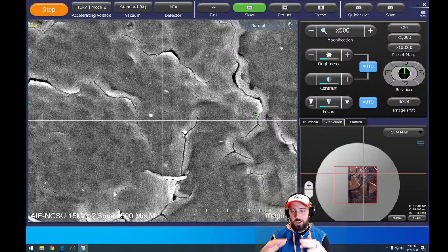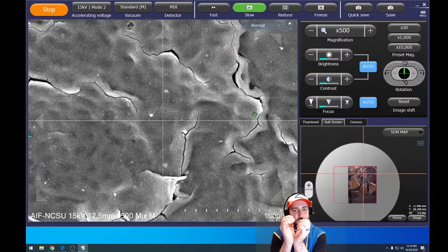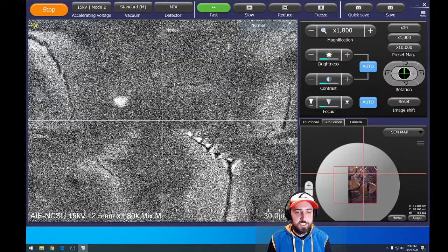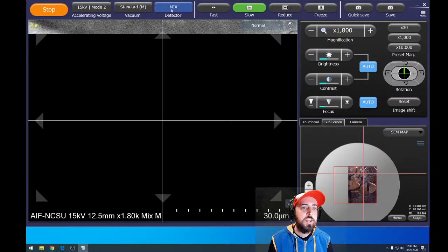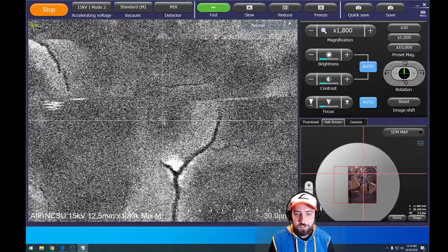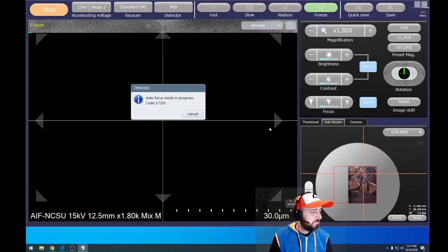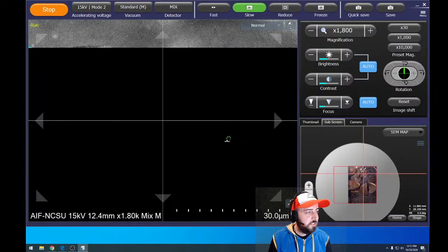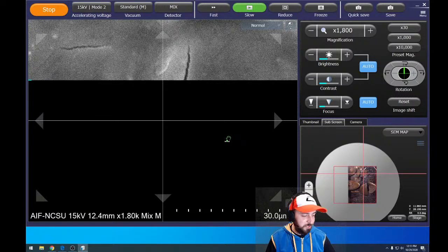And in fact, it was laying flat when I first put it on the stub, but then as the water was being removed, it started curling up. And so I think a lot of the cracks in what we're seeing are like that, just because it was dehydrating. Let's try and zoom in a little bit and then scan even slower. So let's go back to fast and let's look at one of these. And while this picture is coming up, I've learned a lot about pumpkins and squash over the past few days, especially last night.